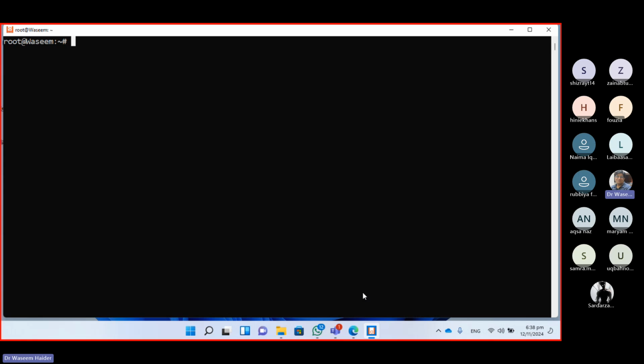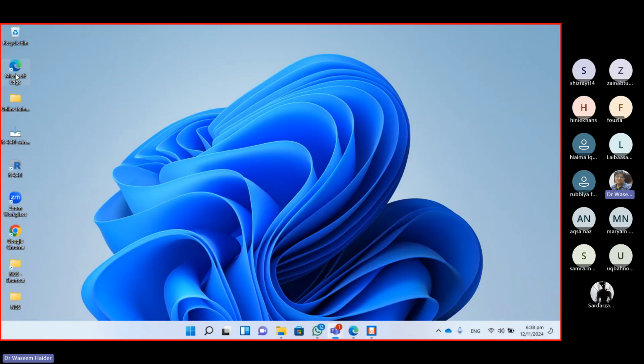First thing I'm going to do is cd, then mnt, then cd again, then mnt, and then log into the Linux system, switching between Windows and Linux. I switched, but now I want to access files that actually belong to Windows.